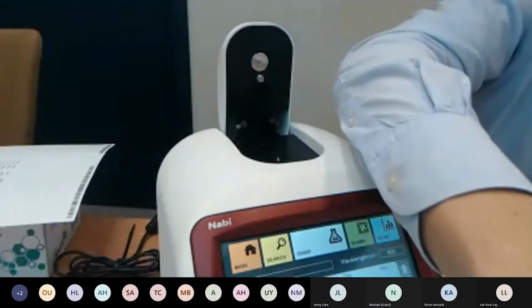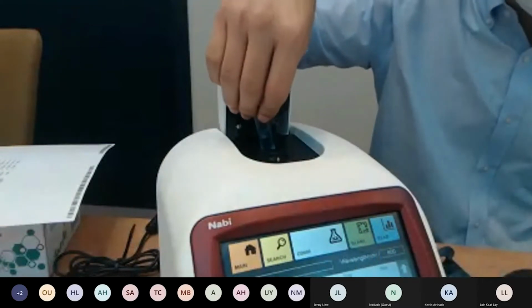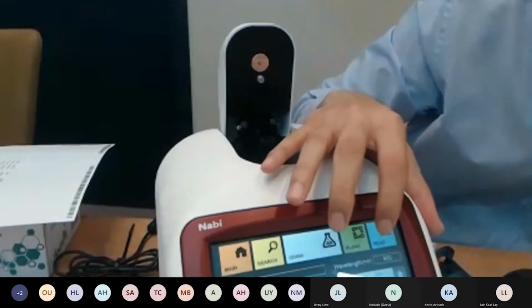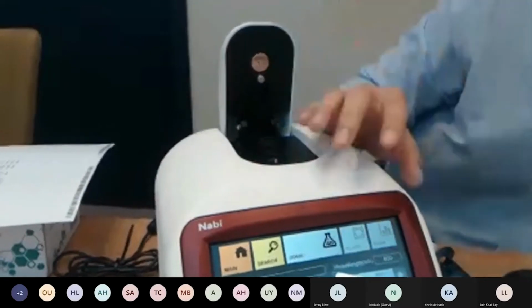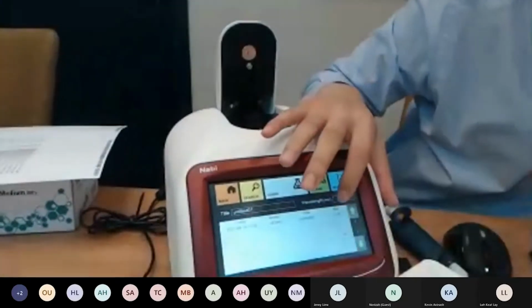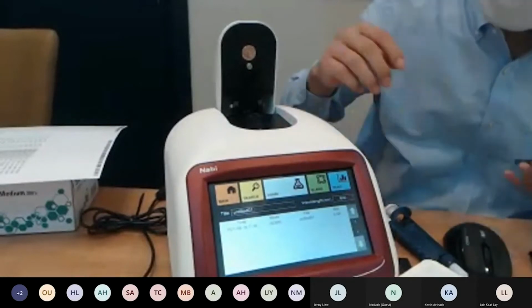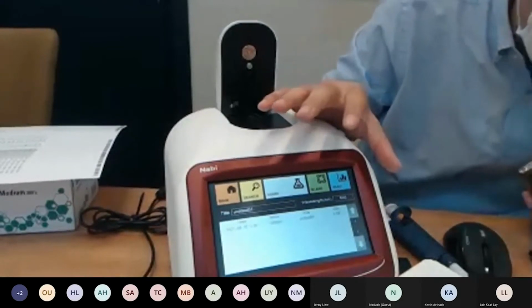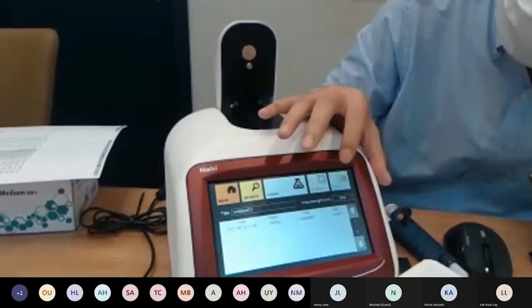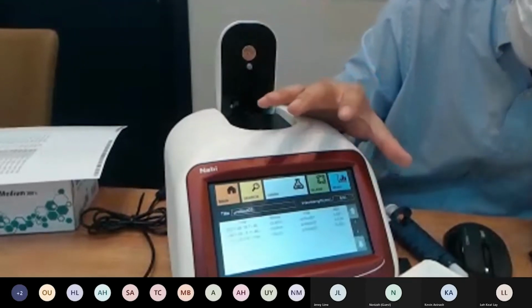Now, this one, let's go to this. We just insert the cuvette, click read, and you can see the absorbance that comes up, which is 0.581. And when you're measuring cuvettes, it's not recommended to measure straight afterwards. I mean, you can read like this, and then click again and read, but this can result in fluctuation.